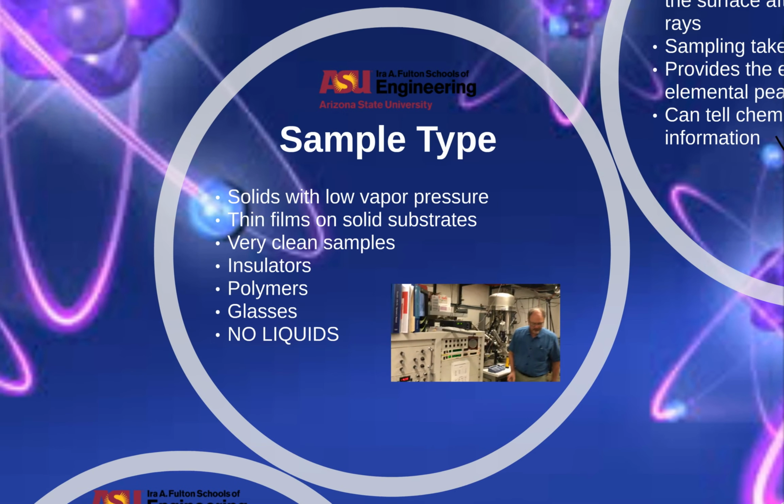Because XPS is run at such a low pressure, no liquids can be used with this technique, as they would vaporize within the chamber.